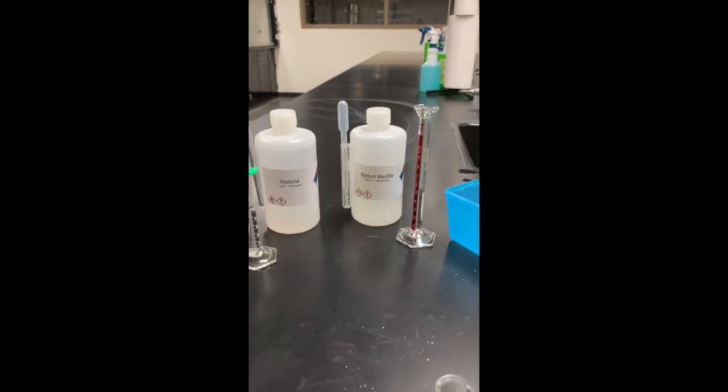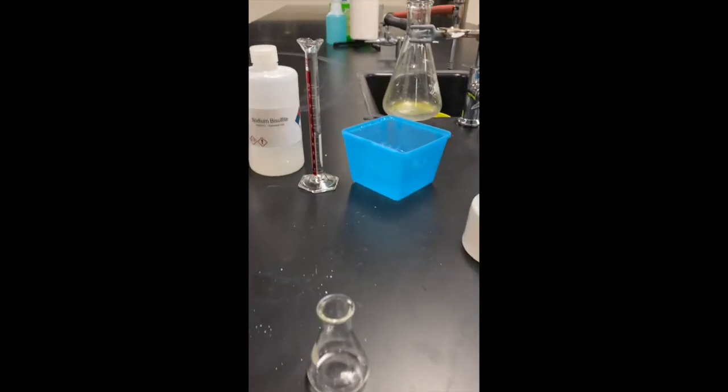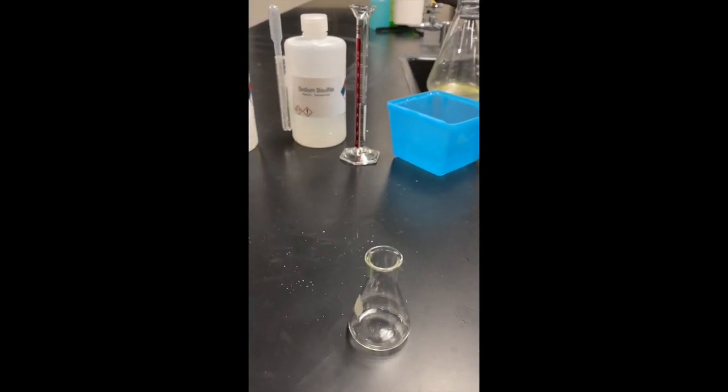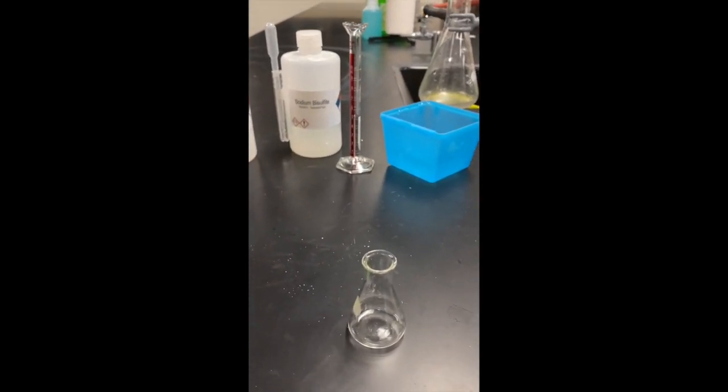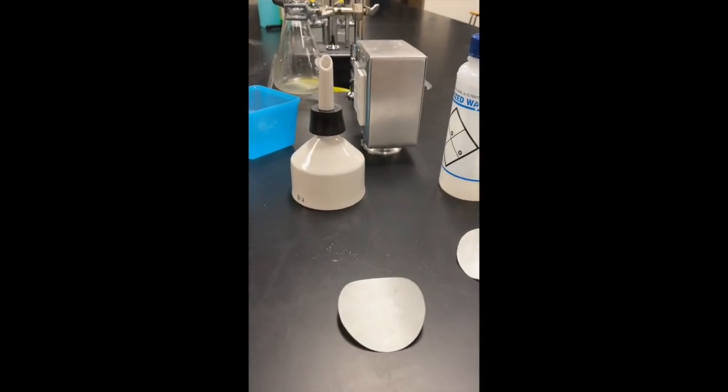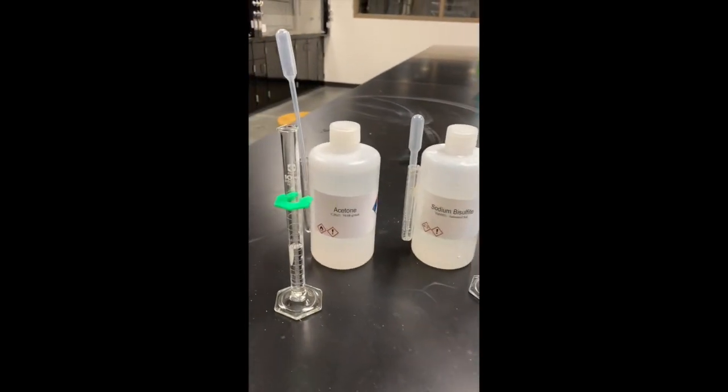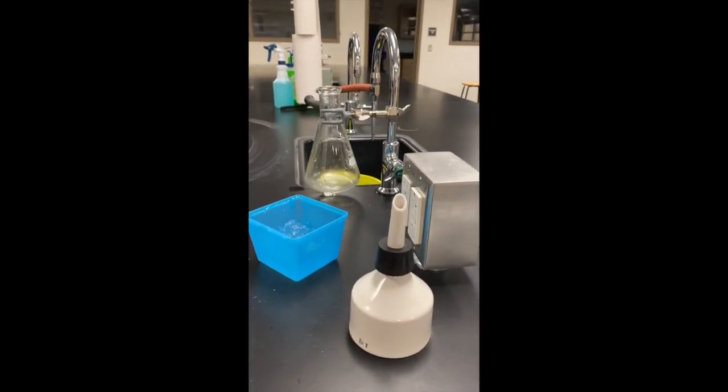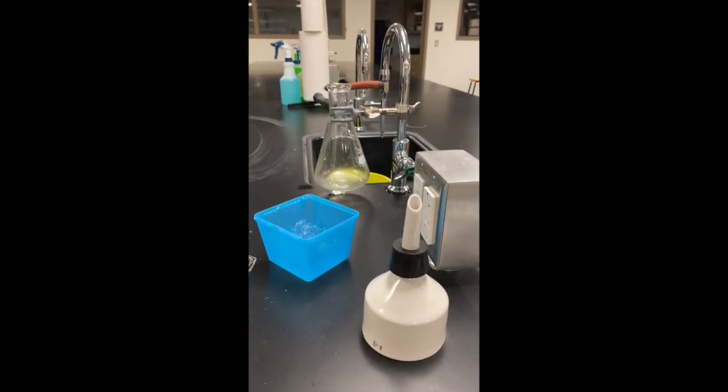For the addition reaction, we're going to put five mils of sodium bisulfite inside of this flask. We're going to let it cool for five minutes. While we're waiting for it to cool, I'm going to go ahead and weigh the filter paper. And after it's all done, we're going to be adding five mils of acetone to it. We're going to get a precipitate and we're going to filter it in the same way we did on our previous experiment.